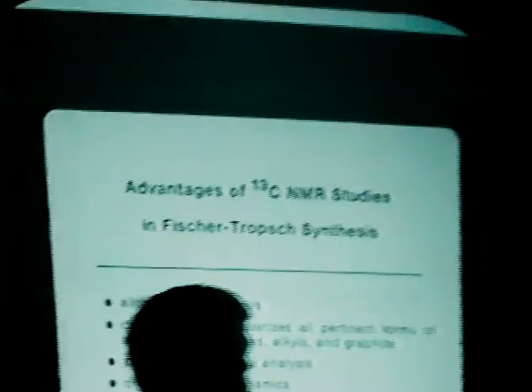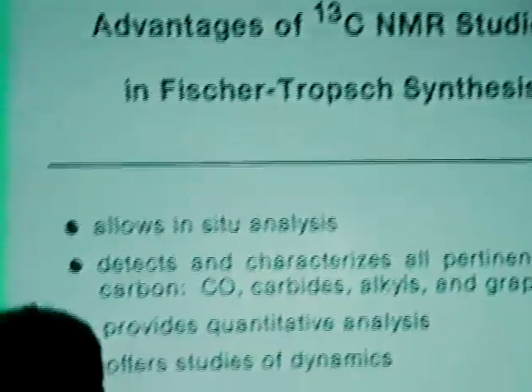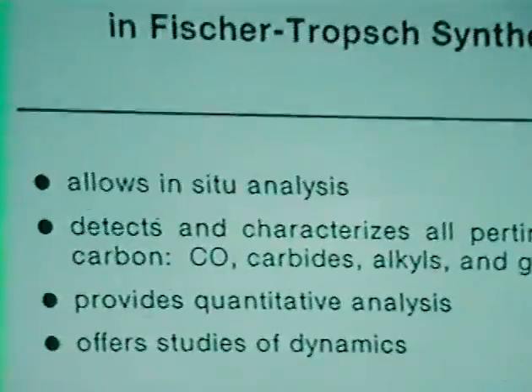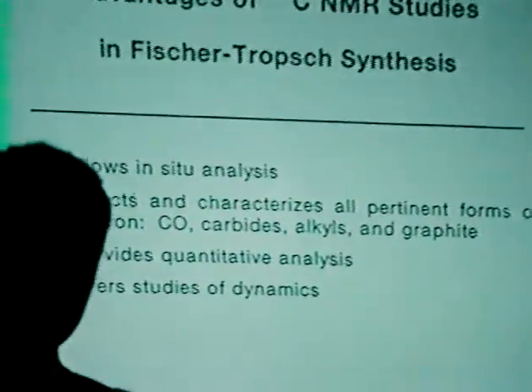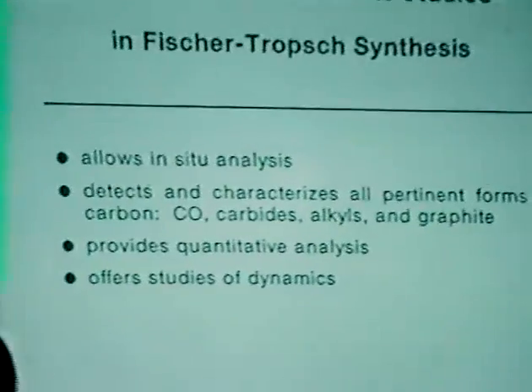Let me give you some background on why we want to talk about the NMR in these systems, and that is the advantage of the carbon-13 NMR in the studies of Fischer-Tropsch synthesis, which I think the chief ones are as follows. First of all, we can do in situ analysis on these materials. We don't have to look at single crystals, we don't have to reduce the pressure or the temperatures in these materials.